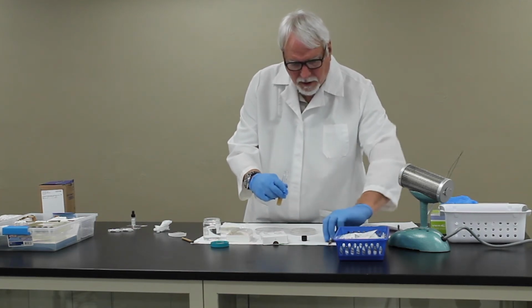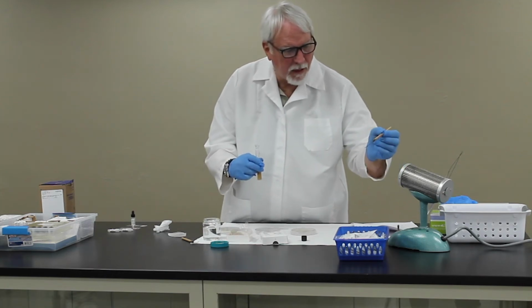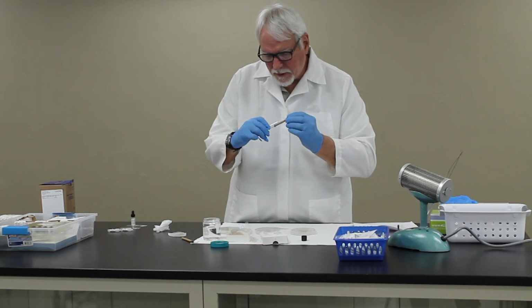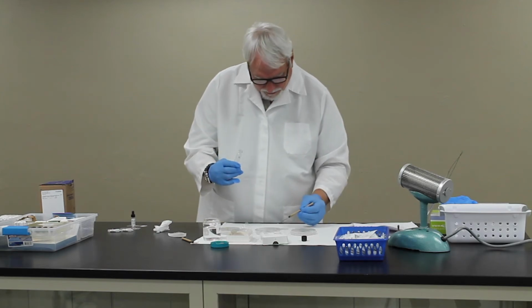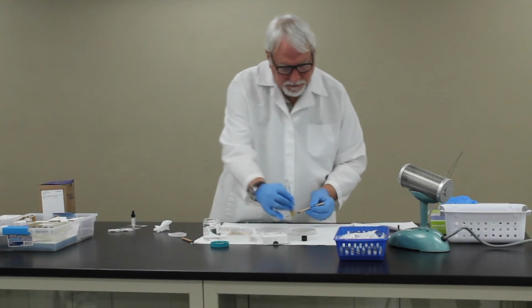But you're going to take some of that material again, dip it in alcohol, flame it off, and then you're going to go in and pick up another bit of the fungus, and you want to get more fungus this time than agar, and you're going to place it in that cotton blue.